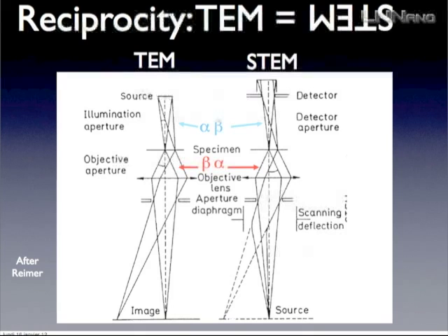I show this because everybody is doing that when making a lecture on STEM. I will not say that I really like it because the question is, okay, that's very nice. It's a little bit conceptual. So what can you do with that? And in fact, it can be helpful if you are a skilled TEM guy. Because if you are a skilled TEM guy, you know every prime that you can have on your column.